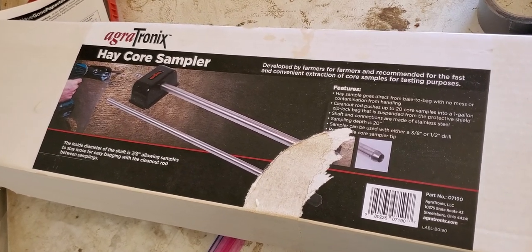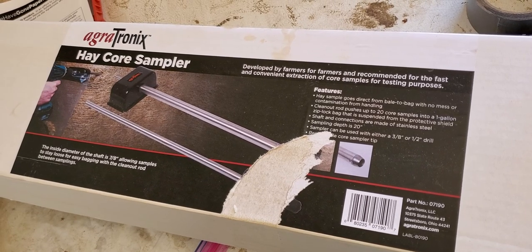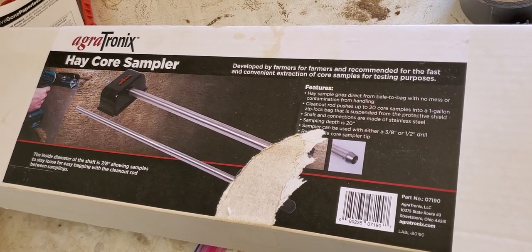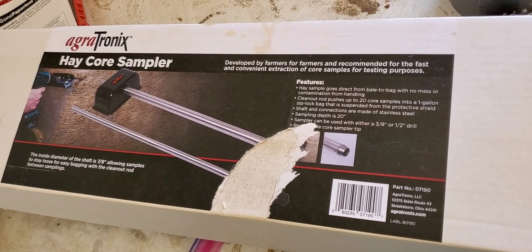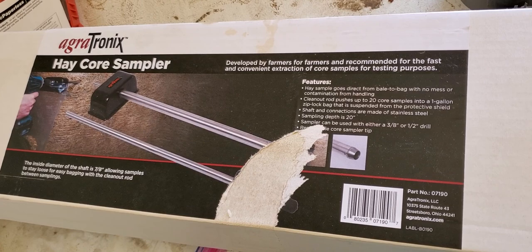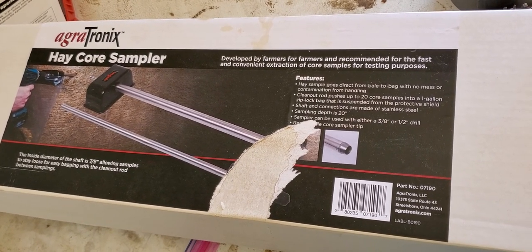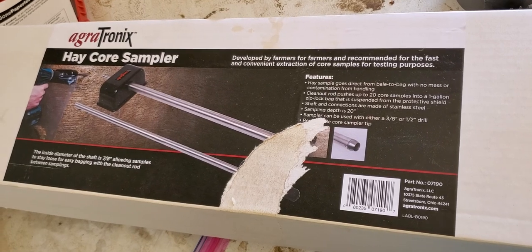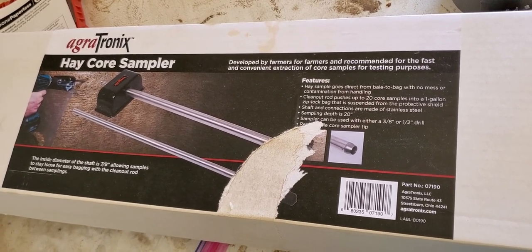Last year I bought one of these hay core samplers from Agritronics. I believe I ordered it from ValleyVet, which was the distributor I got it from. I'm going to show you how I put it together — it runs with a handheld drill — and then I'm going to show you the sampling process.